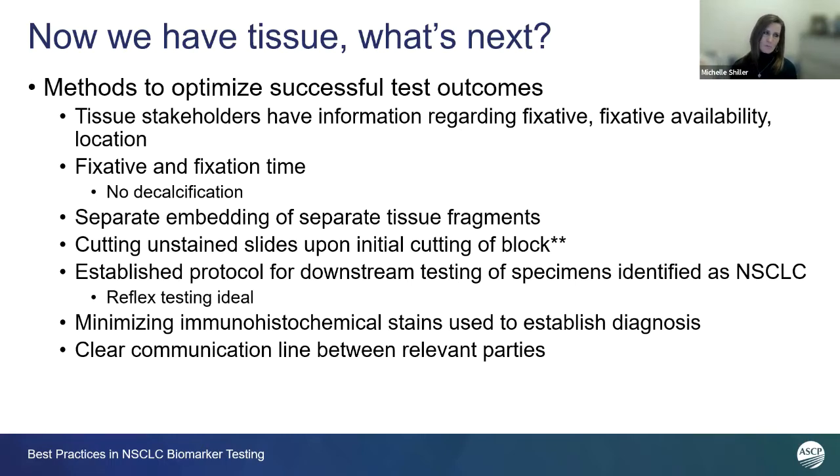There are other things, like what type of fixative. The most common, of course, is neutral buffered formalin, and most testing is validated on specimens that have received neutral buffered formalin as a fixation. Recording fixation time is also important. While we think about this probably with breast cancer, where it's more scripted, fixation time does impact the downstream success of testing. The cold ischemic time particularly negatively impacts the ability to get good sequencing data, due to the fact that the DNA starts to degrade readily once it's cut from its blood supply.